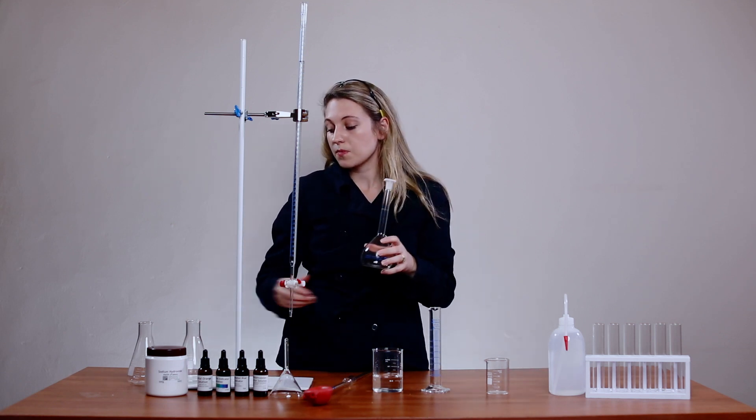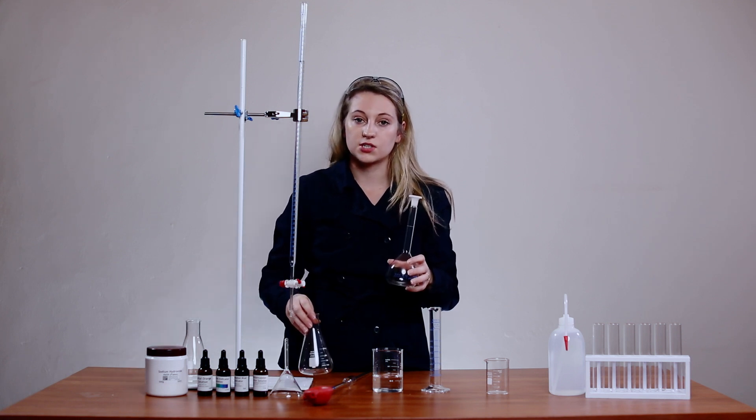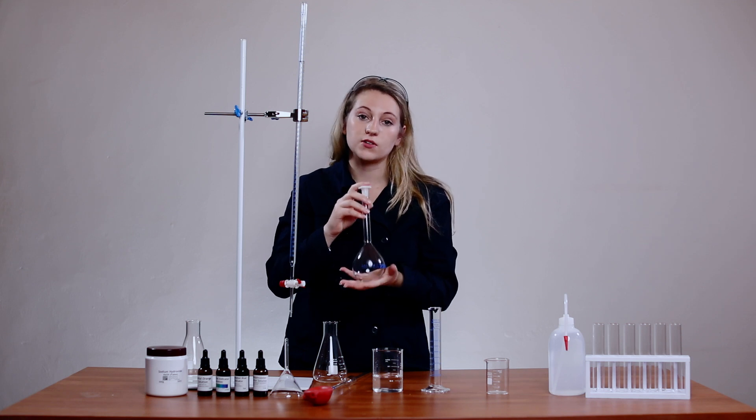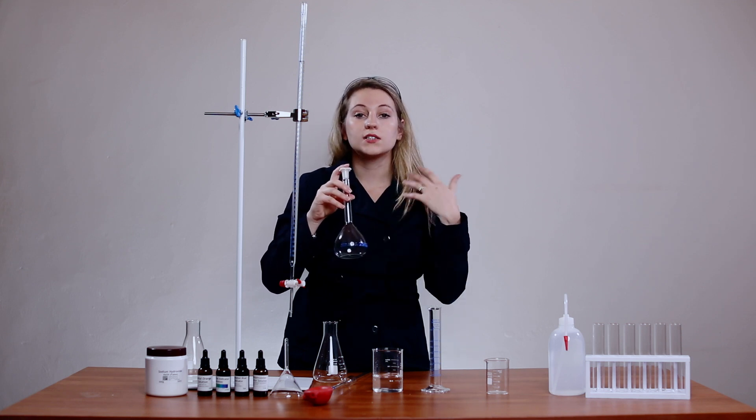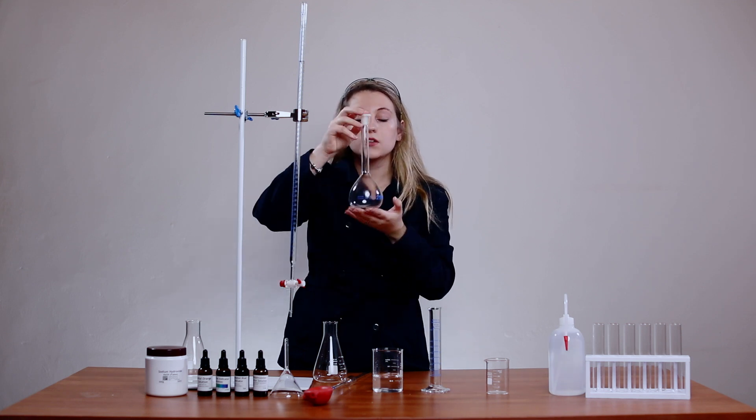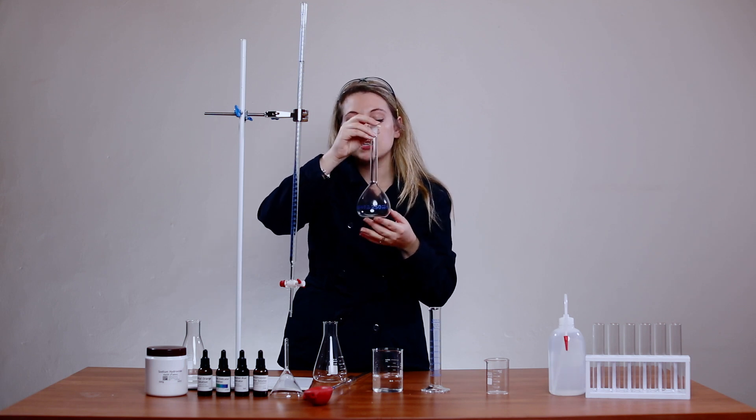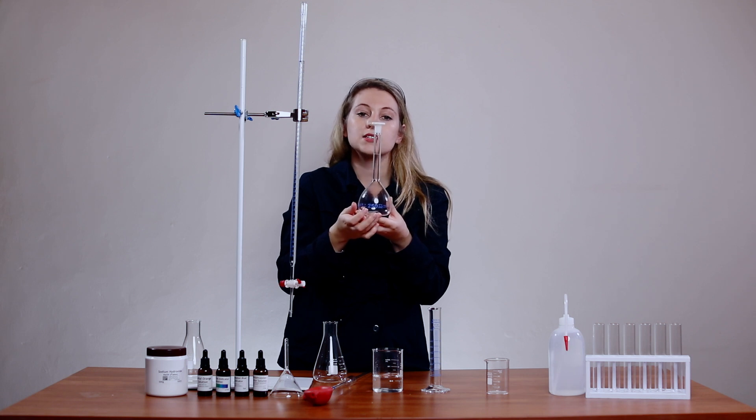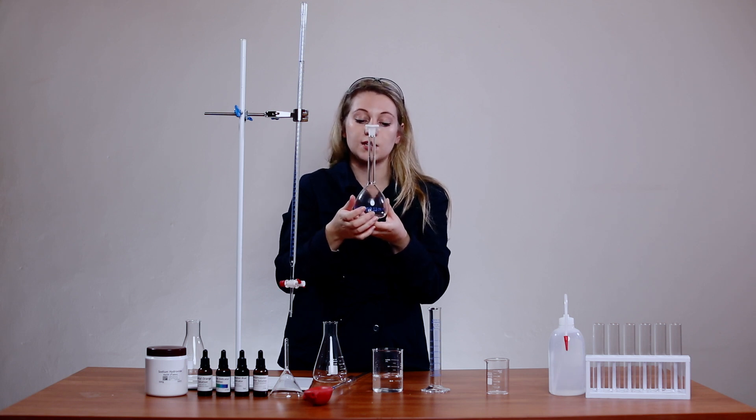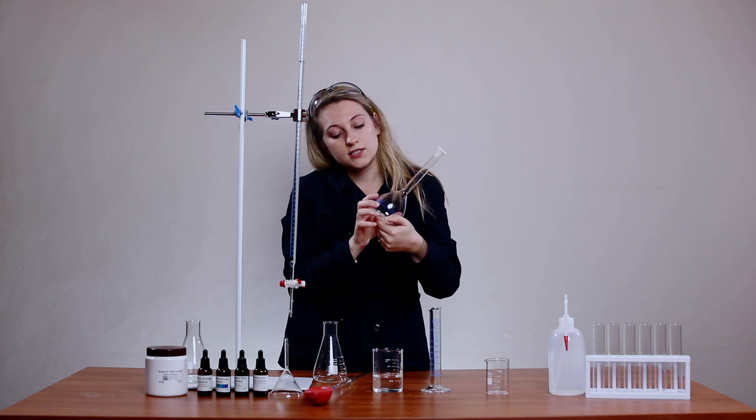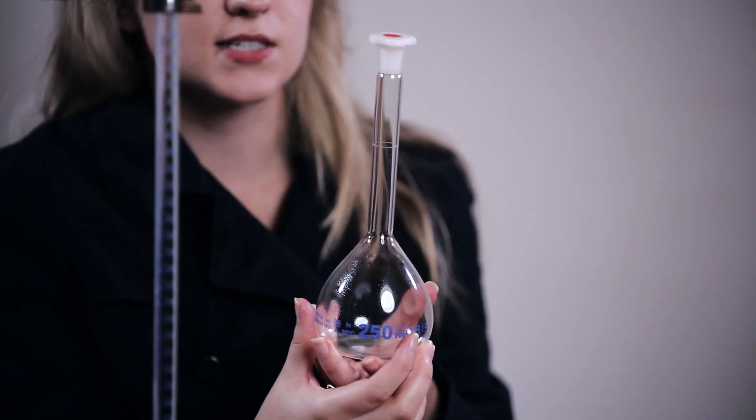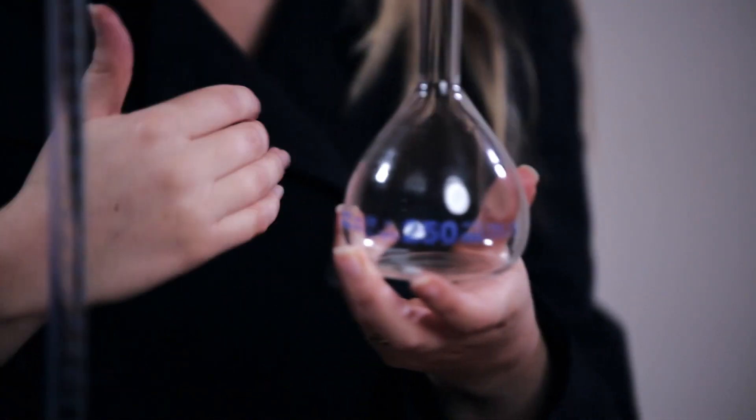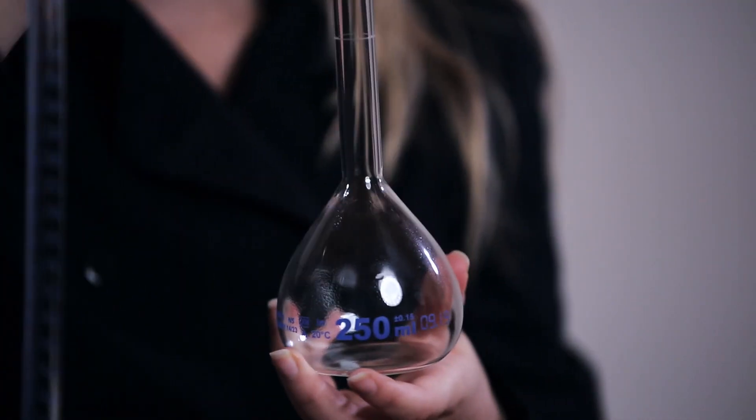When you want to prepare a solution, let's say a standard solution with a known concentration, or you just want to dilute an acid, we're going to use a volumetric flask. This volumetric flask is 250 milliliters or 250 cubic centimeters and it also has an accuracy of two decimal places, so when you record the value in volume you would say 250.00 cubic centimeters.